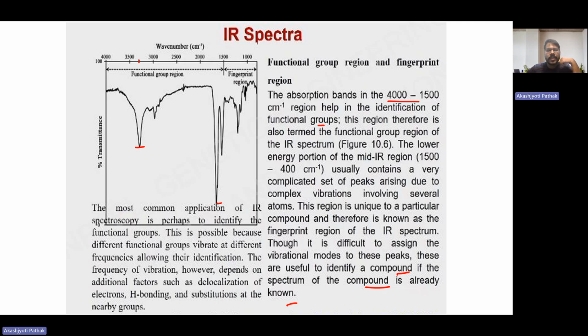So utilizing this fingerprint region, we can identify which compound is present in the sample.